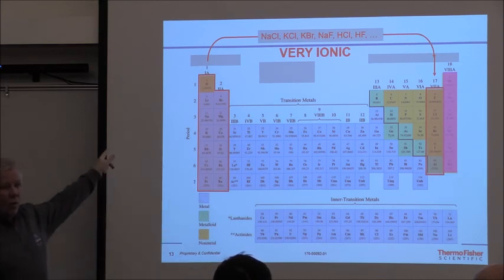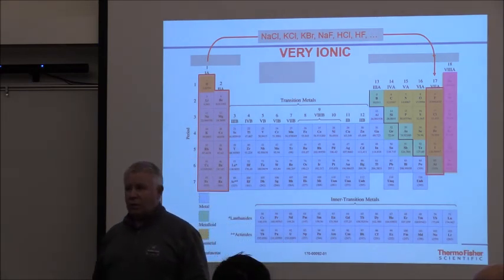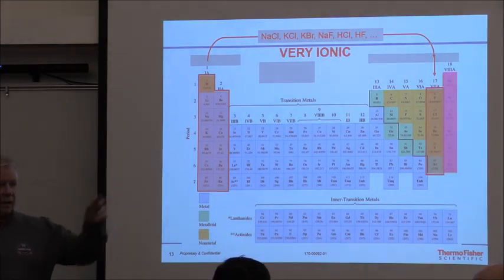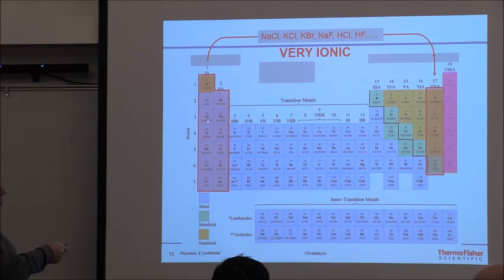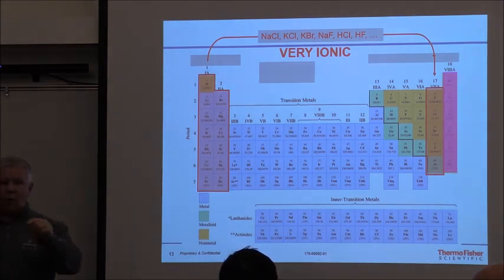Now, let's do nitric acid, which is hydrogen, nitrogen, and oxygen. I've got hydrogen in group 1, but I've got nitrogen in group 15 and oxygen in group 16. Should it be able to see nitric acid? The answer is yes. Why? Because the nitrogen and the oxygen form the covalent complex. So all of a sudden the device says, I can see nitric acid, but I can't see hydrochloric acid. Okay? By the same token, sodium and chlorine, like I said, table salt, can't see it. Okay? Potassium chloride, can't see it. Can't see sodium chloride table salt.